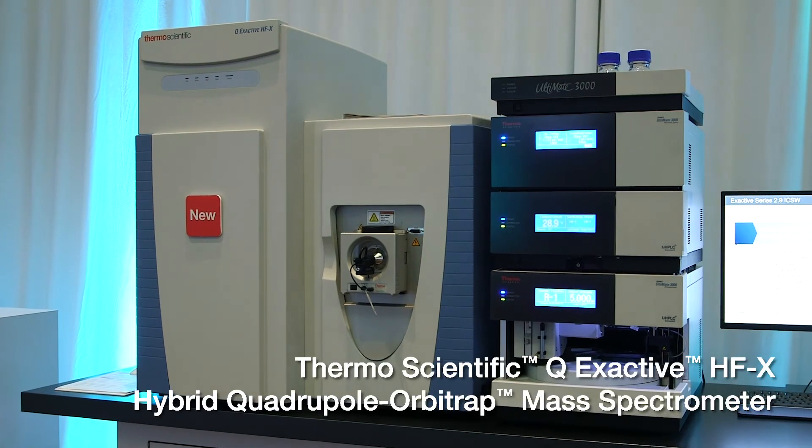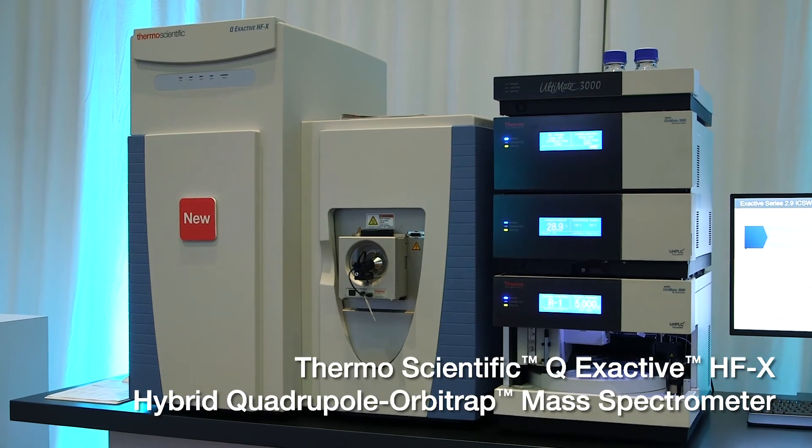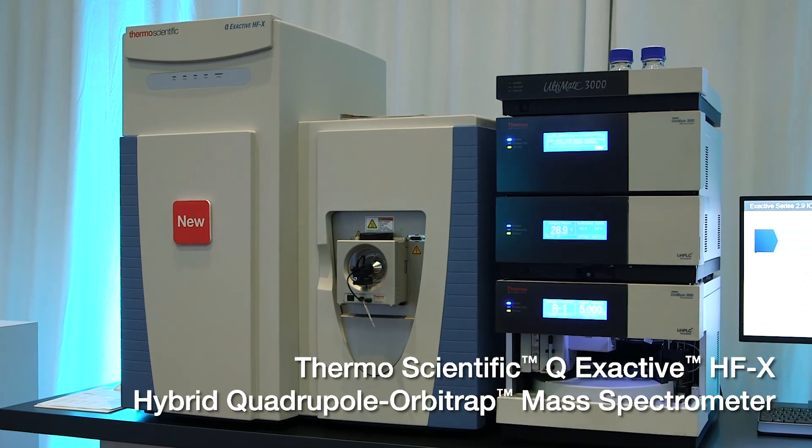For customers using analytical scale chromatography, very often they have a requirement to improve their sensitivity by moving to capillary. With capillary LC-MS you can make it a lot more sensitive — sometimes as much as 50-fold more sensitivity depending on what they're trying to analyze — so moving to a capillary column for those customers is very important.